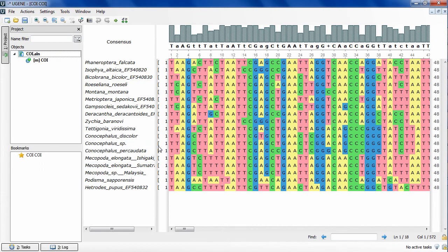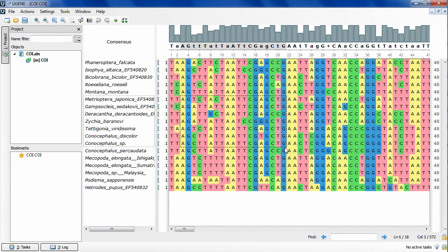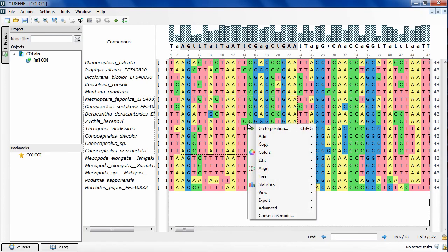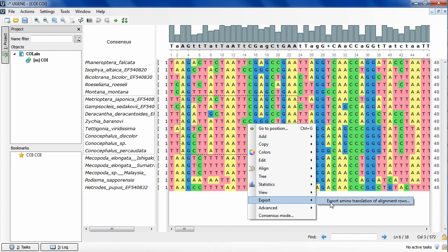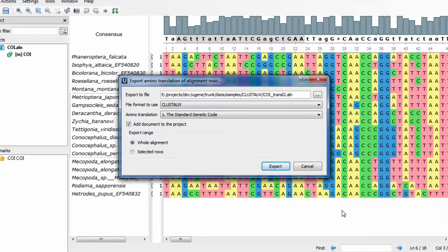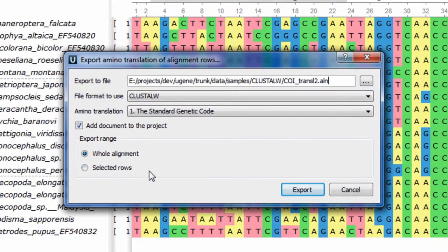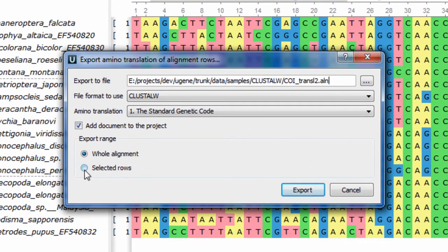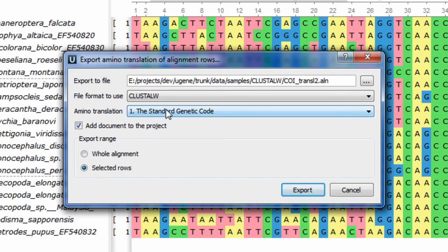There are two new features for multiple sequence alignment editing. To see the first one, right-click on a nucleotide MSA area in the MSA editor and select Export, Export amino translations of alignment rows, to export the selected rows or the whole alignment into an amino alignment. The translated alignment is saved and can be automatically opened in the current project.